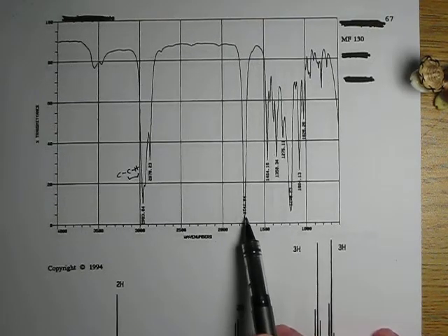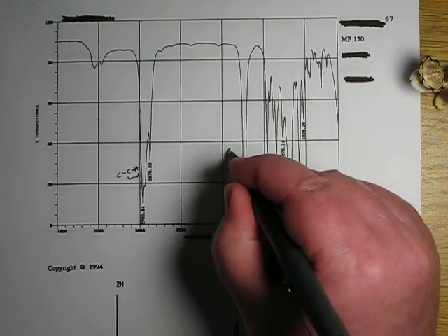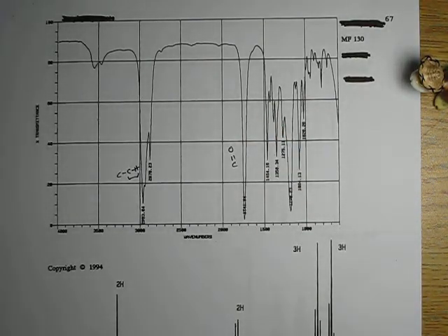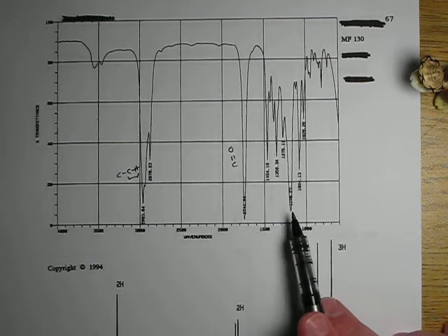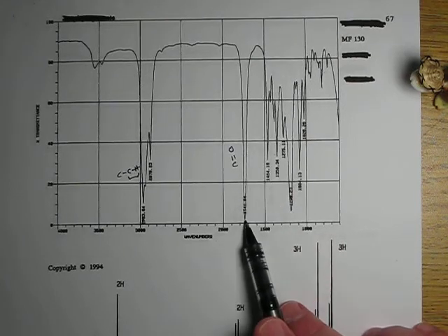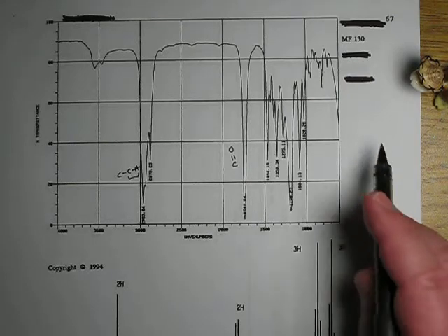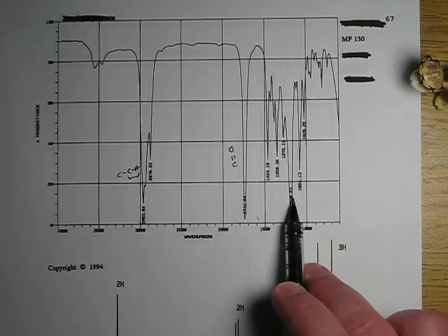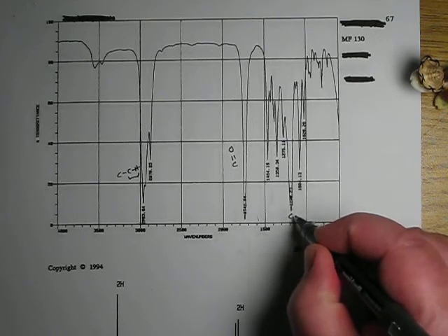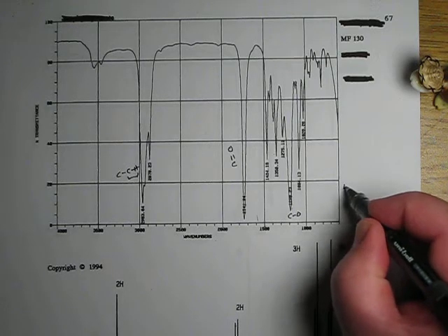Ooh, but what do we have here? 1741 wave numbers. Okay, there's some good stuff there. There's a carbonyl. And let's see, what else do we have here? Ooh, I've got this big peak right here at 1190 or something like that, and it's kind of wide, and it's almost as deep as this carbonyl peak. Now, I could be wrong, but when I see this carbonyl peak and this wide peak right there, I'm thinking this is a carbon-oxygen bond, and I am right now thinking ester.